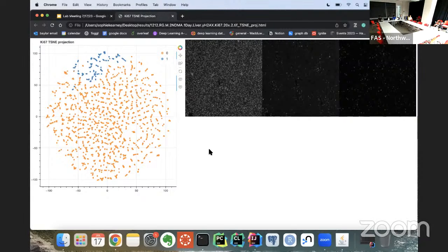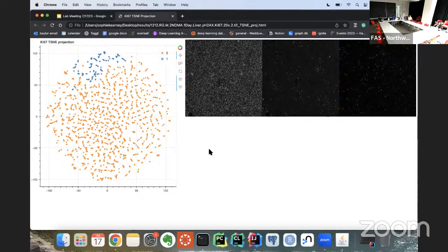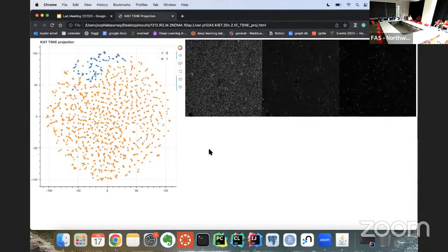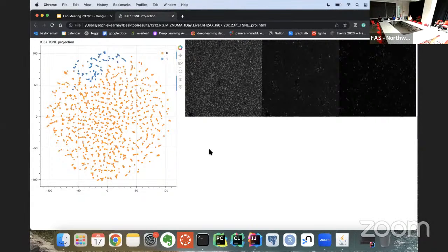But the thing is, there's no object detector there, right? That part is done beforehand. In this case we have bigger images with multiple cells. The tool is set up with an object detector at the beginning of the pipeline, and then the visualizations are done on that image.